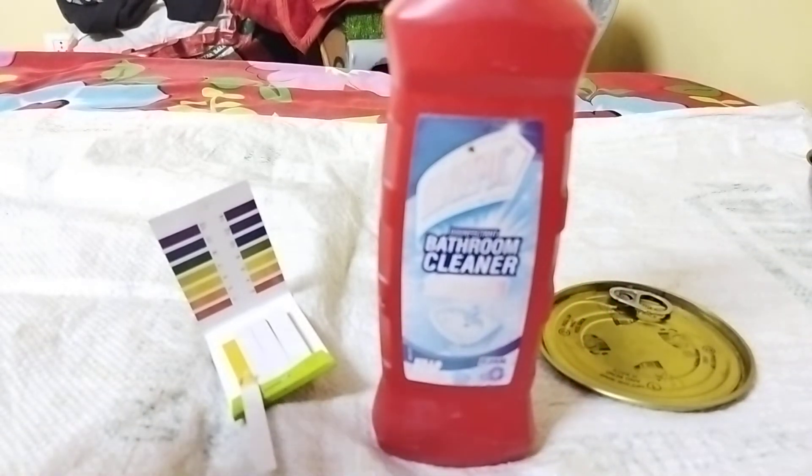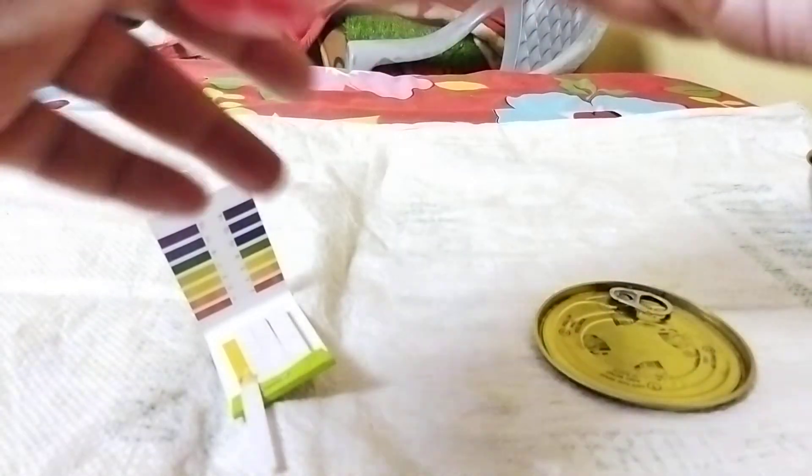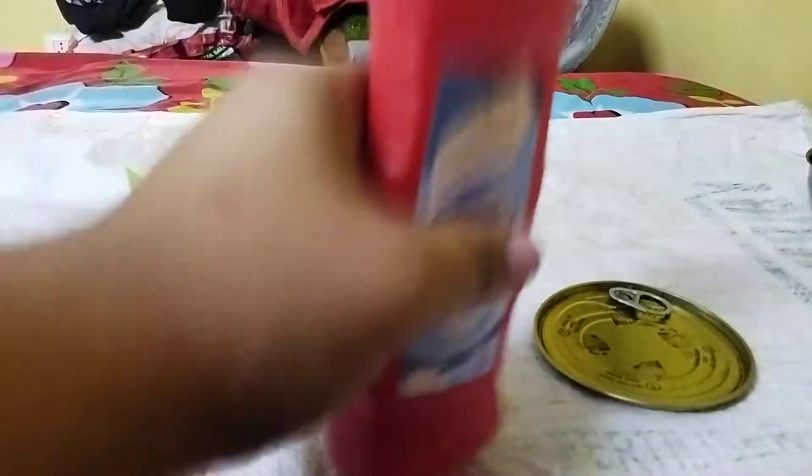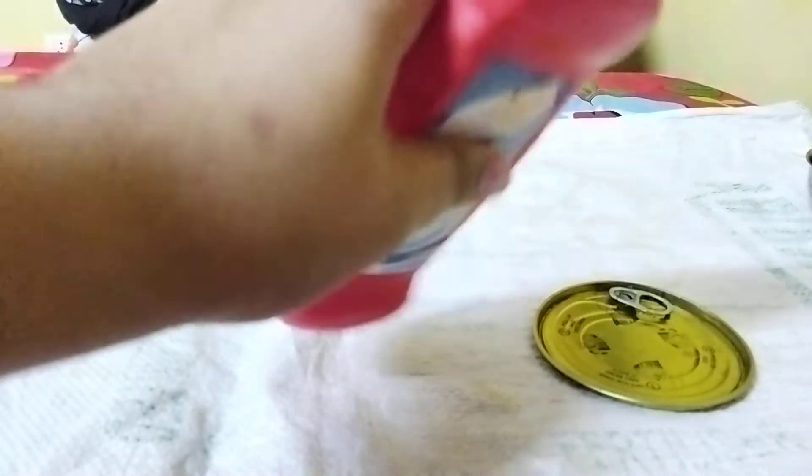I'm having this red Harpic bathroom cleaner. You may be having a different one because Harpic comes in different colors and for different purposes. I'm just shaking it a bit so that the solution can be more homogeneous. I think that would do.